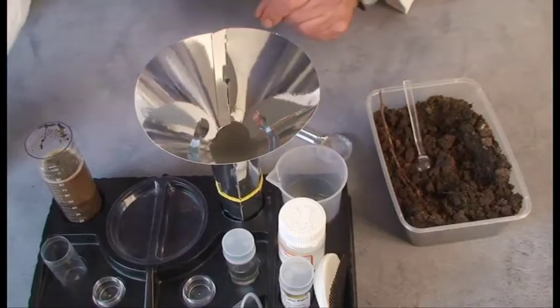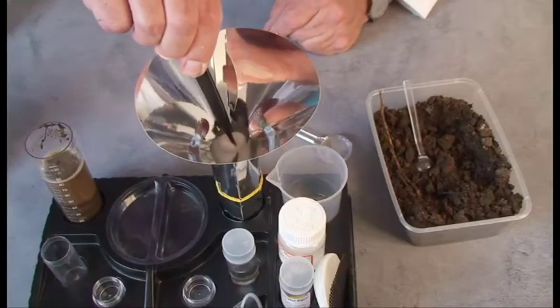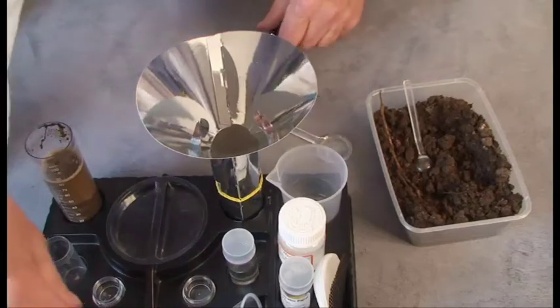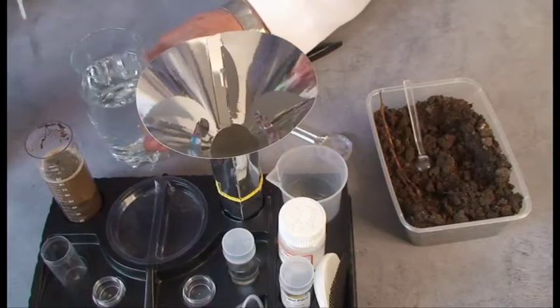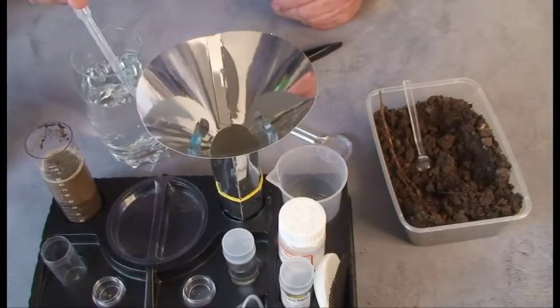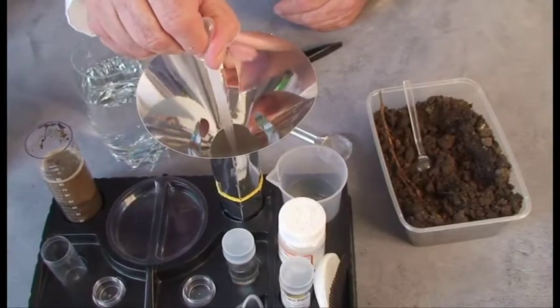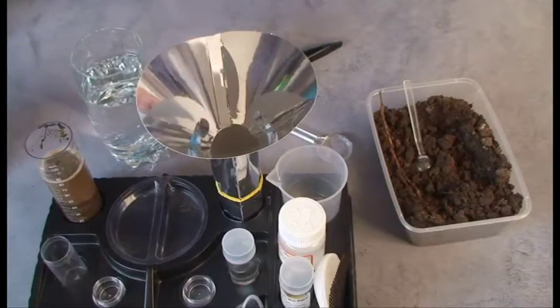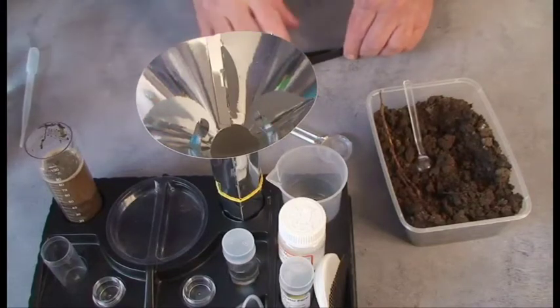First we need to set the funnel up. The first thing I do is put a cotton ball at the bottom of the funnel. Next, we get some ordinary tap water, and I take 3mls of water with the pipette and squirt it down the bottom. Why do we do that? Well, we're going to scare tiny animals into the bottom of the funnel. They love humidity, they like damp, but they don't want to drown. So the water is held in the cotton ball.